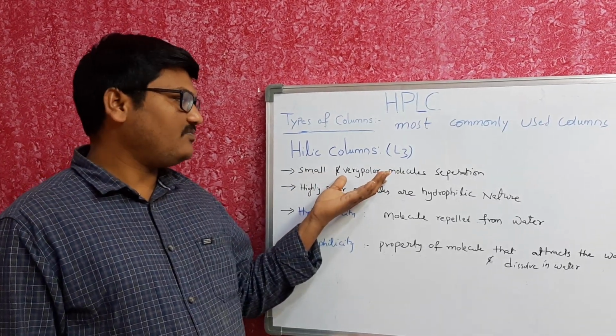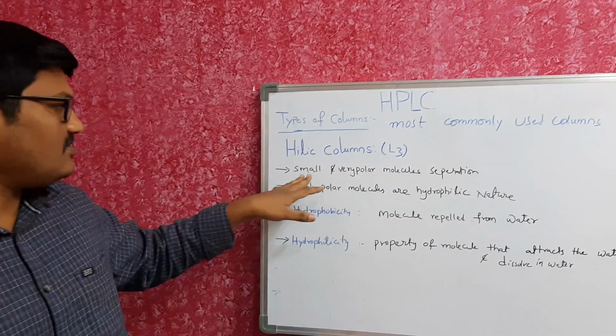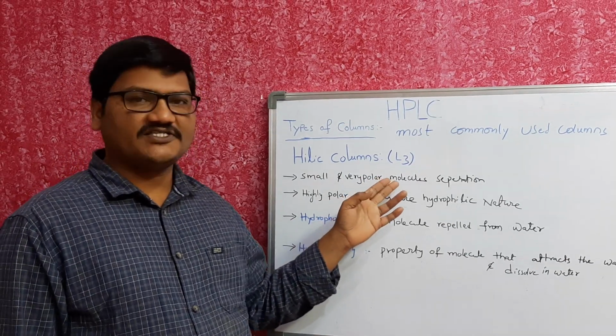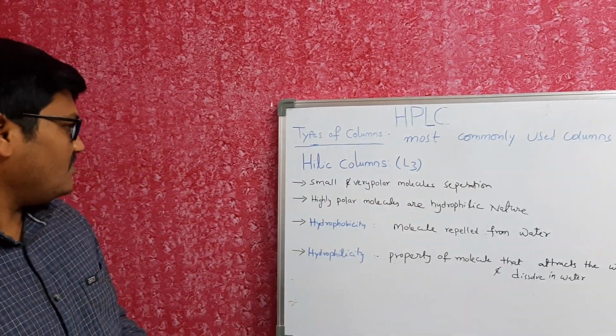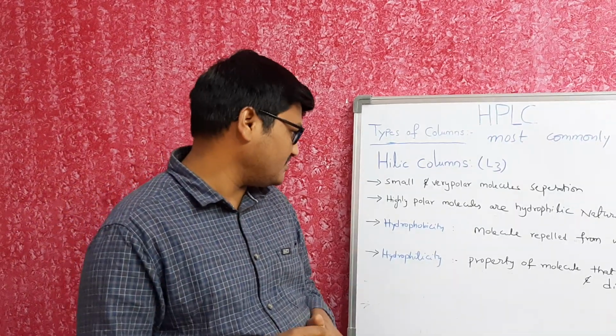These highly polar molecules have very high hydrophilicity. Here we can discuss what is hydrophobicity and what is hydrophilicity.